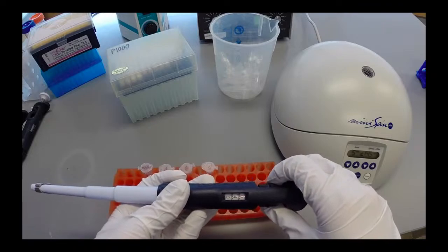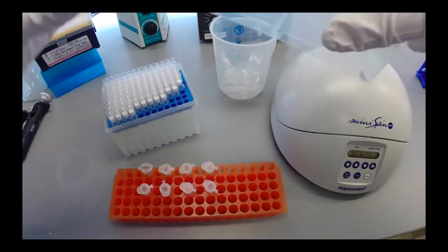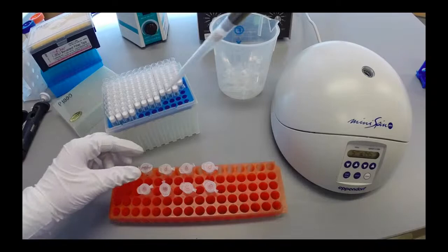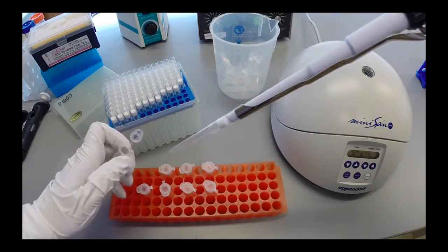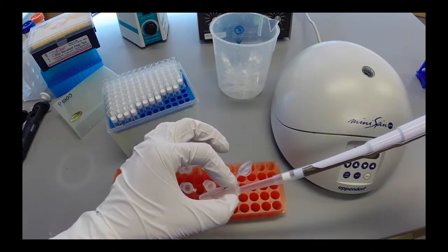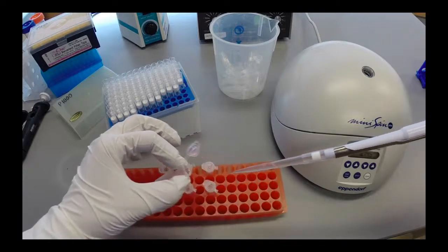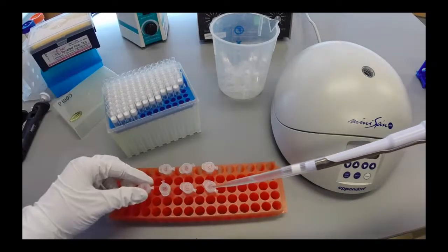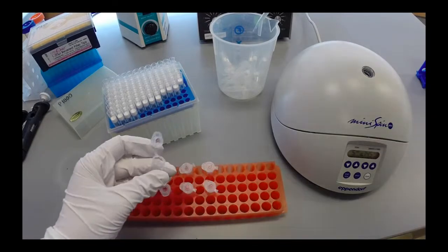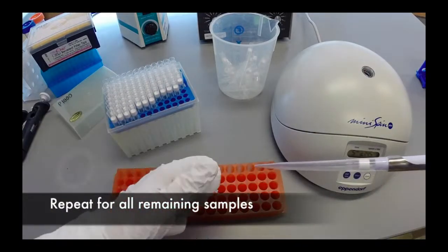Using the P1000, transfer 400 microliters of supernatant, which contains the DNA, to the new tube. Place the tip on the opposite side of the tube from the pellet and draw up slowly to avoid disturbing it. Repeat this process for the remaining samples.